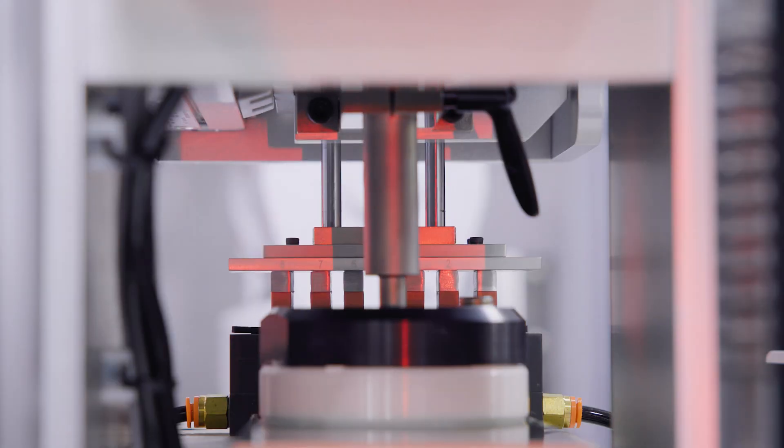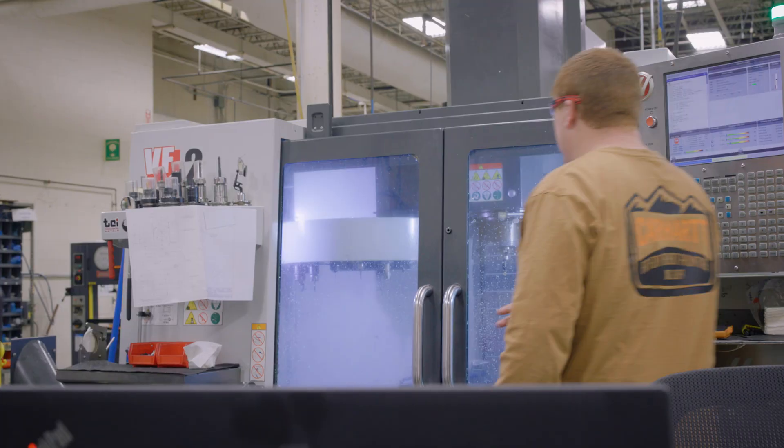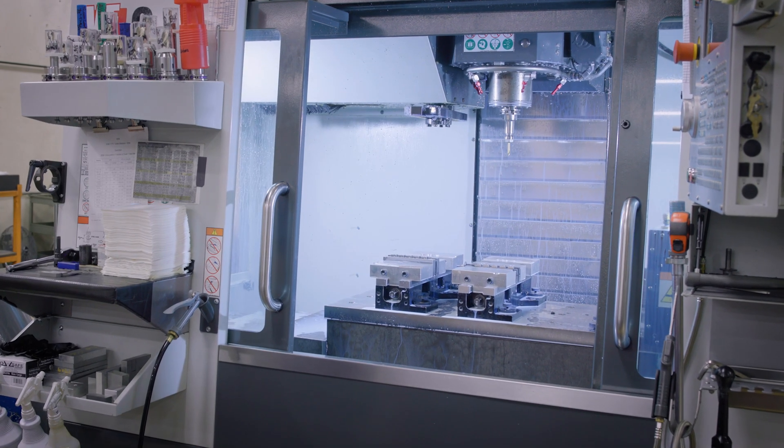When customer testing calls for unique solutions, this facility has a dedicated team of machinists that works with Instron's engineered solutions group to design and manufacture custom products tailored to fit any application needs.